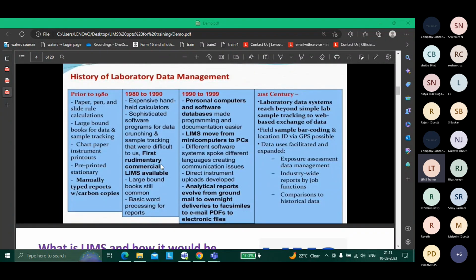But just creating software is not enough, right? Because if you want to create a LIMS application, it has to meet your GxP guidelines. And electronic signature is also a must, 21 CFR Part 11, which I think most of you belonging to the pharma industry will know. We will touch that later. But then came the need for developing LIMS.